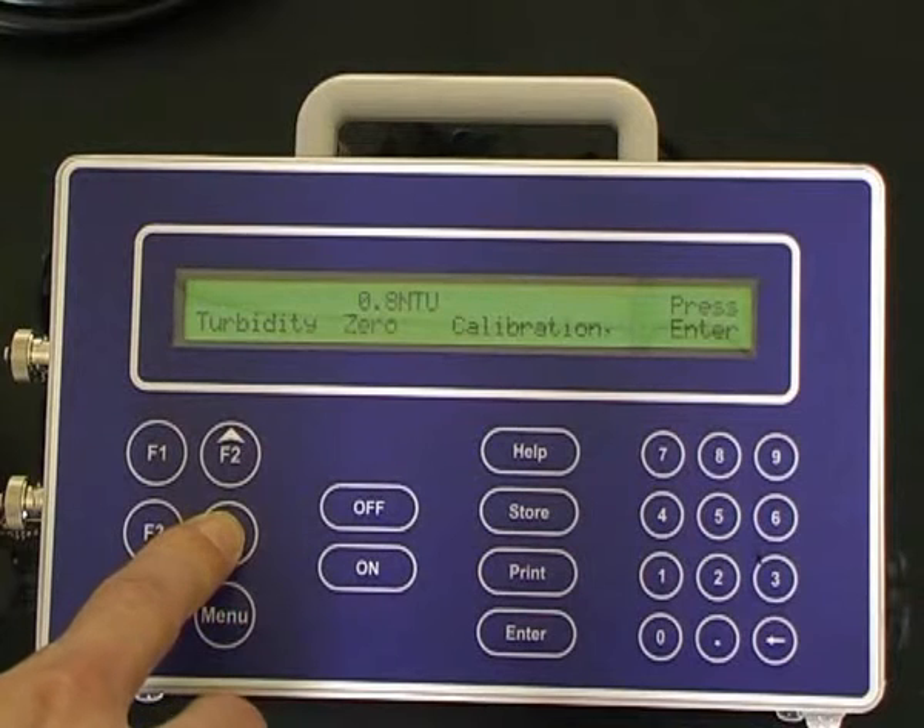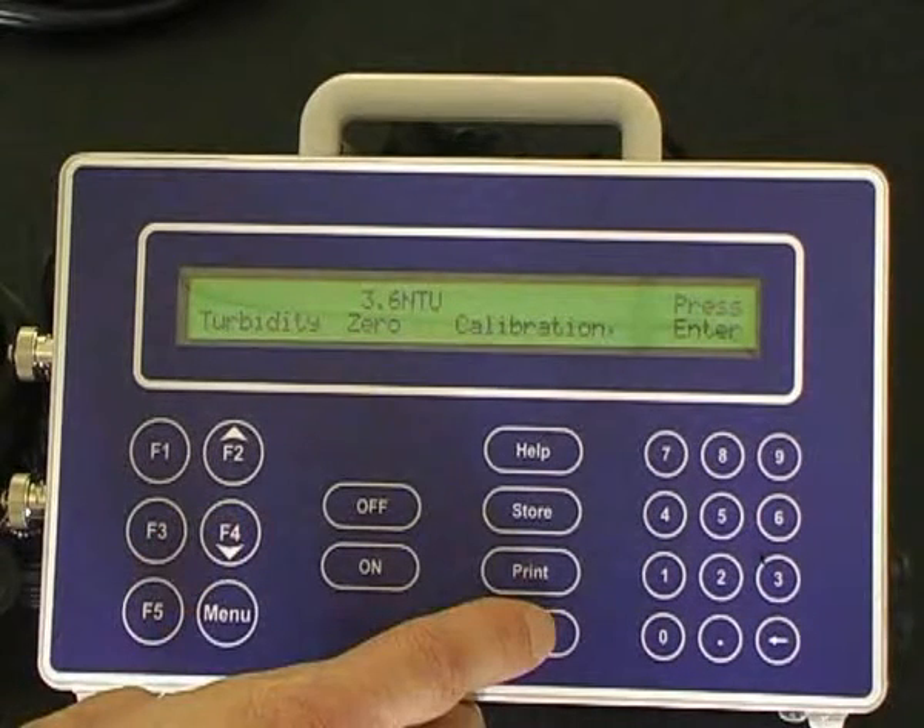Select F4 for turbidity for the first point turbidity calibration, which is zero in deionized water. Allow the sensor to equilibrate. Once the sensor has equilibrated, press the enter button.